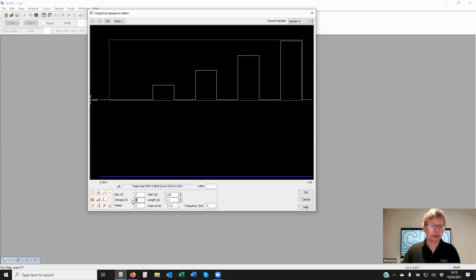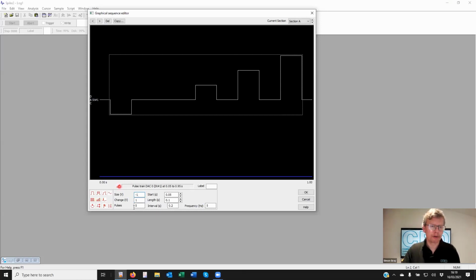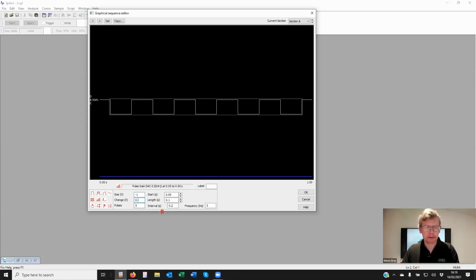Okay, starting at, say, -1, so we can see there are actually 5, stepping by 0.2, there we go. Right, so you're building a list of DAC outputs. DAC 0 is told to go to 0, then DAC 0 is told to go to -1, a delay, then go to the next step. So you're describing the points of change here.